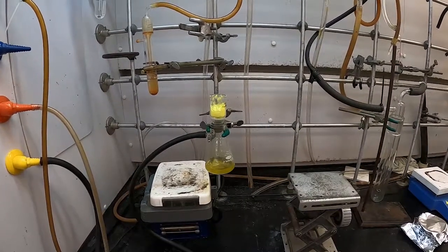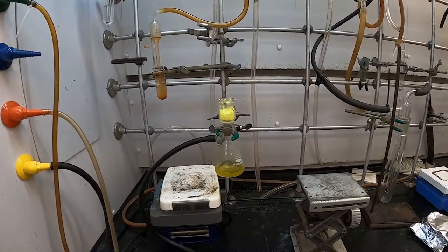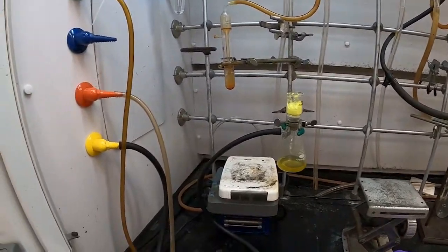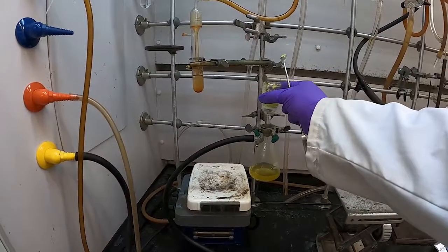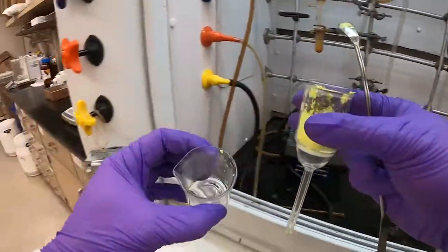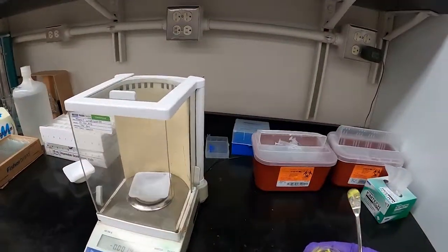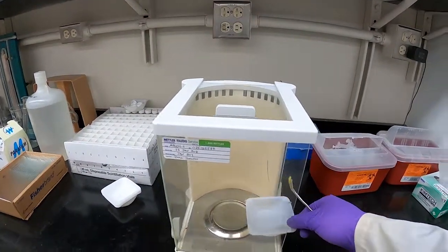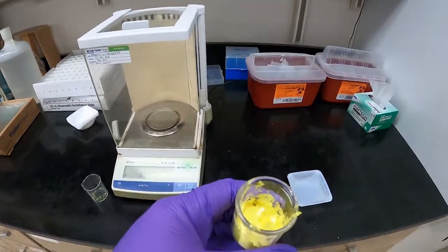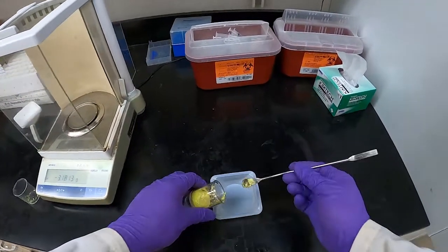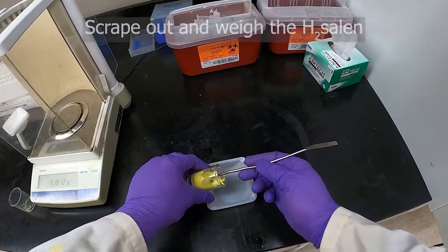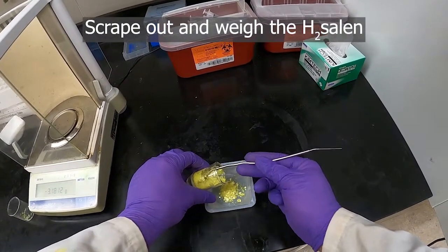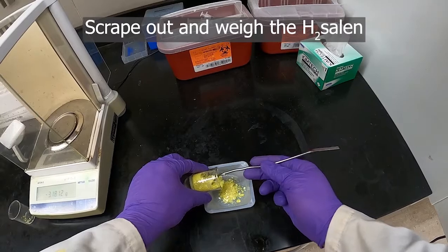So our salen has dried on the vacuum now. Go ahead and turn the vacuum off. Come over here, got a weigh boat already on the balance. Scrape this lovely yellow crystalline compound into the weigh boat here.